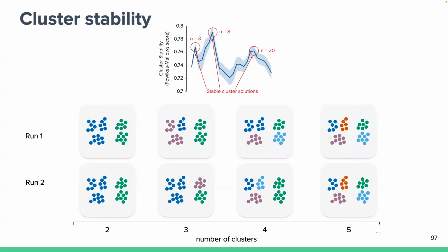So we designed it because CellCharter is particularly scalable. 90% of the time that is spent in CellCharter is dimensionality reduction. So clustering takes a few seconds or a few minutes, so repeating that multiple times is not a huge problem. But of course, with more expensive clustering algorithms, this clearly is not the best approach.